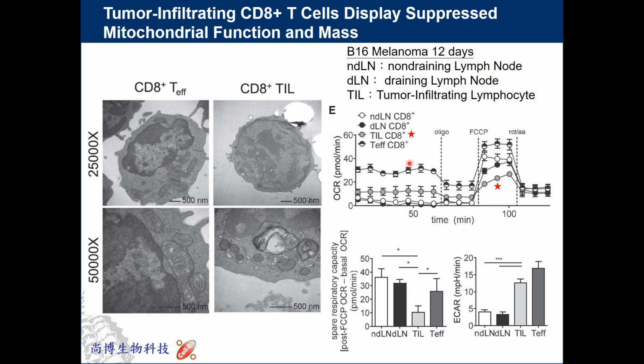So we have 4 different conditions. Here is a T cell, the gray circle. And here is a cell line for the positive control, so we can ignore it. And the other 2 are from the lymphoid node, just a different way to take it down. So it is very similar. It's just taking it from the lymphoid very smoothly, or using a physical force to drain out the lymphoid. So it is almost the same.